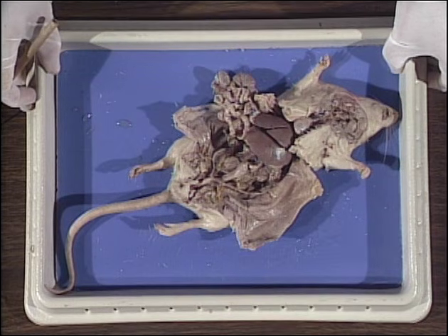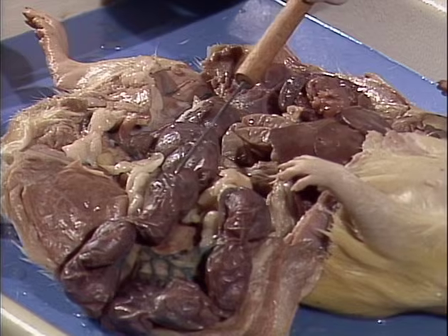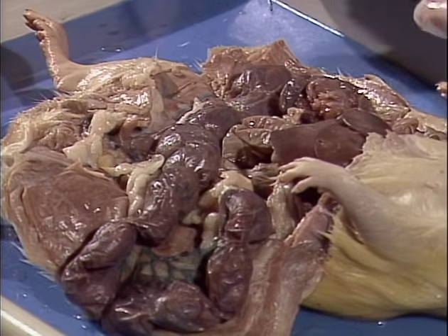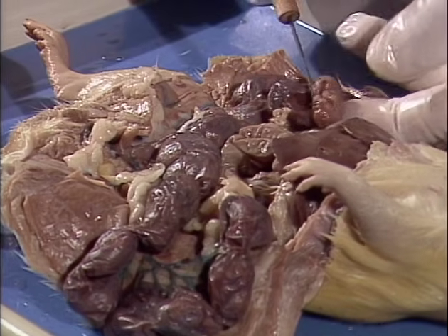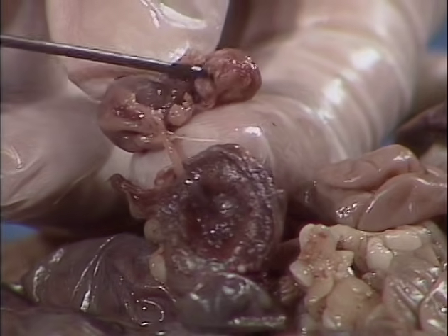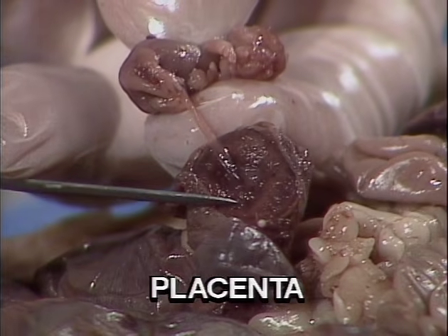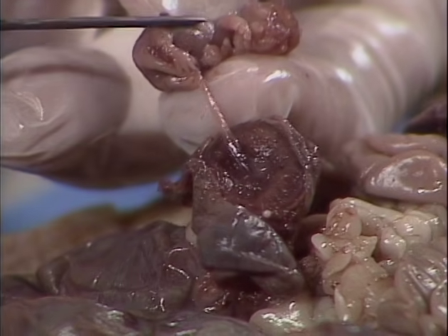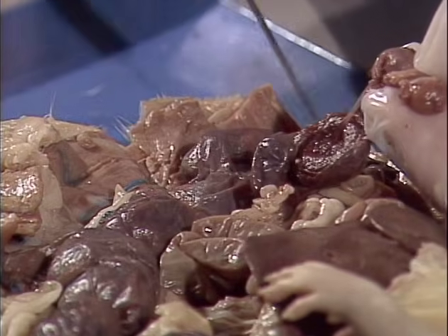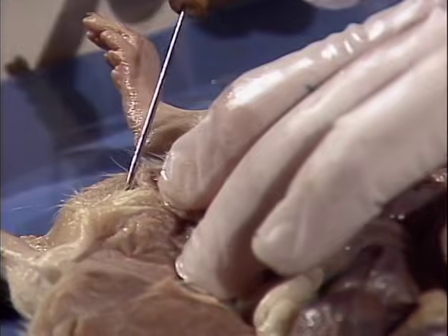We have a rat who is pregnant, and we'll now look at her. The masses we see in the uterine horn contain little baby rats. I have opened one of these up to show you its contents. And in here we see this small rat connected by the umbilical cord to the placenta. When it is time for it to be born, this little rat will move down the uterine horn, through the cervix and the vagina, out through the vaginal orifice.